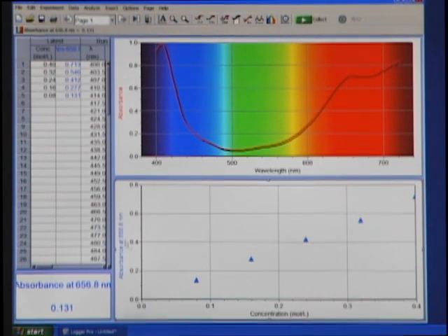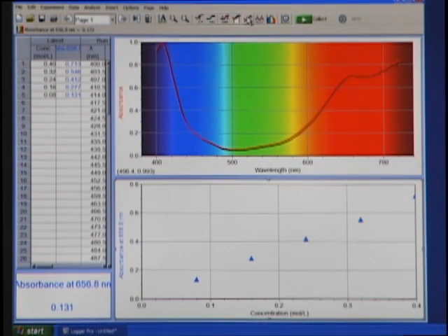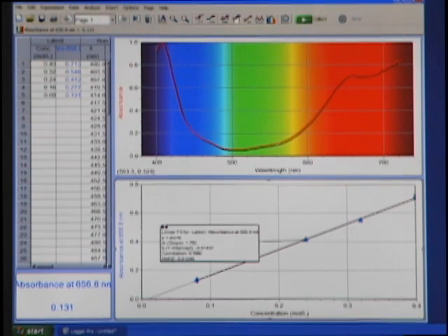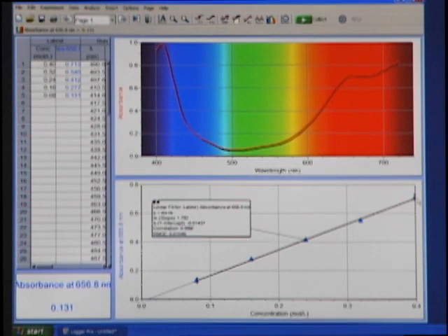You always hope for a linear relationship, and the students can discover that. They're also quite interested. There's a good indication of how well they prepared their standards when they put on a linear fit. To do a linear fit, up on my toolbar, we have a linear fit button. And so I'm going to go up and click on that. When I do that, notice that I get a best fit linear fit line displayed on my graph.